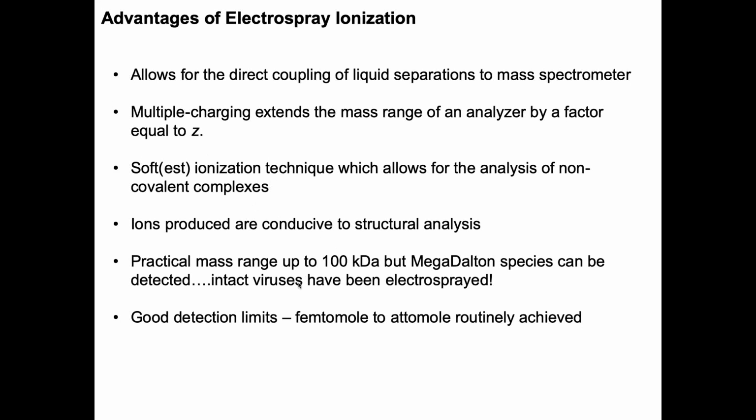I've got SEM images of craters where they've hit, but it's usually been multiple times. I think it's on the order of nanometers as far as what actually gets off the surface. I'm trying to give you a number, but I don't know if that's complete, and I'm having trouble remembering exactly what those slides said. But a lot of that has been built into a modern MALDI-based system. A lot of those parameters that you used to mess with have been squeezed out of the system, and they've really got the key things that are going to give you data.